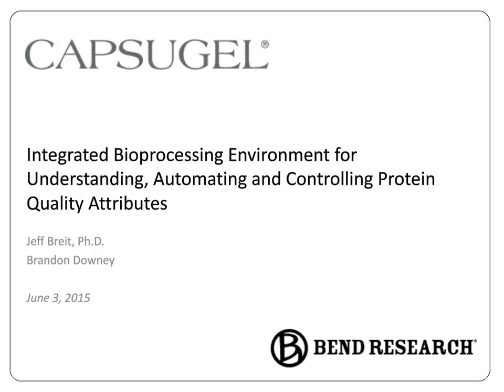So the title of today's webinar is Integrated Bioprocessing Environment for Understanding, Automating, and Controlling Protein Quality Attributes. And the goal of this webinar is to present work we're performing in the area of biologics manufacturing, specifically the integration of bioreactor sampling technologies with PAT tools and process optimization around critical quality attributes of therapeutic proteins. As stated in the title, we're in the process of tying these technologies together and using them to develop a control platform focused on optimizing protein CQAs.